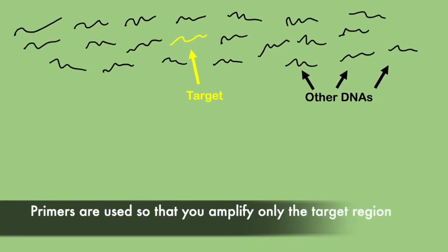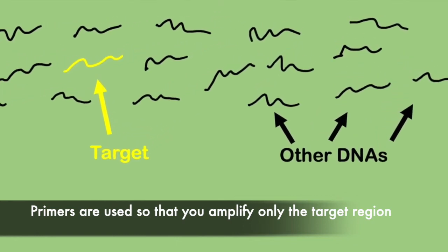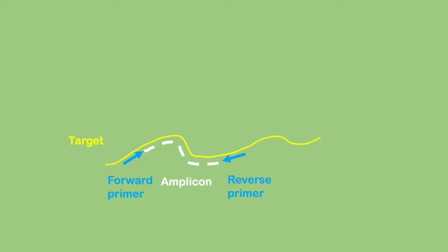So in terms of design, most of these things stay relatively standard, though there are lots of different Taq and buffer combinations that are designed for specific applications. For example, you might use a different Taq for long or hard to amplify regions than more generally. The area where you'll do most of your thinking is in the design and the optimization of the primer sequences. Just like in the reverse transcription reaction, primers are short stretches, this time of DNA, that bind to specific regions of your target. In this case, you need two: a forward primer and a reverse primer. And ultimately, the PCR amplifies the region in between these two primers. So you just need to decide where the primers are going to be placed.